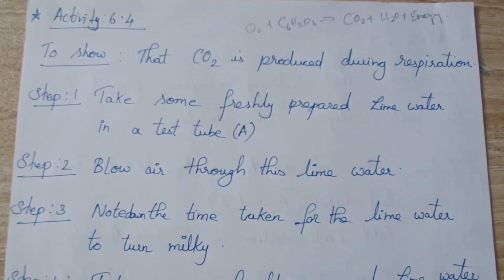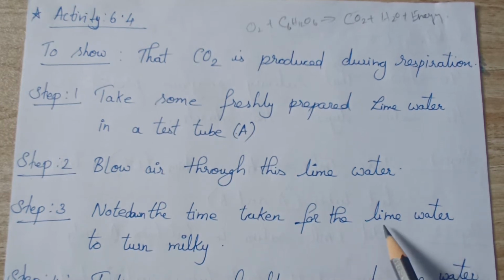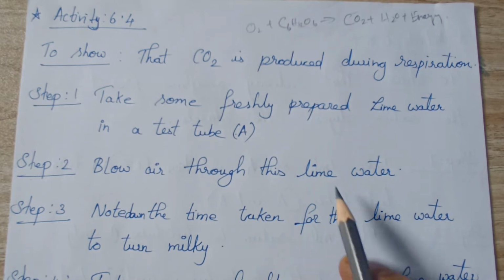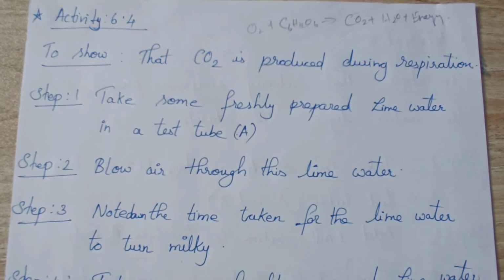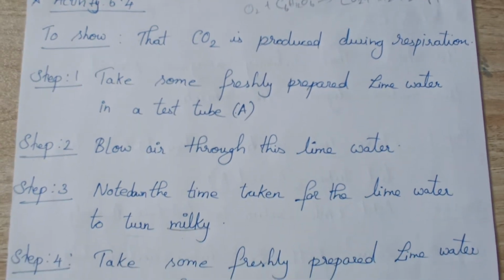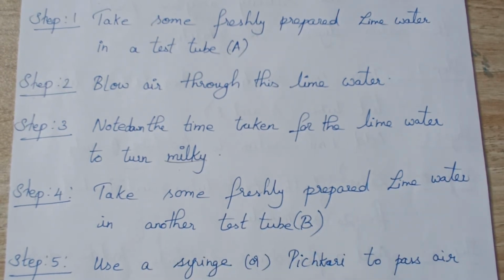So what is the reaction taking place here? When you blow the air from your mouth into this lime water, it turns milky. You have to note down how much time it will take for the lime water to turn milky. Next, in another test tube, test tube B, take some freshly prepared lime water.